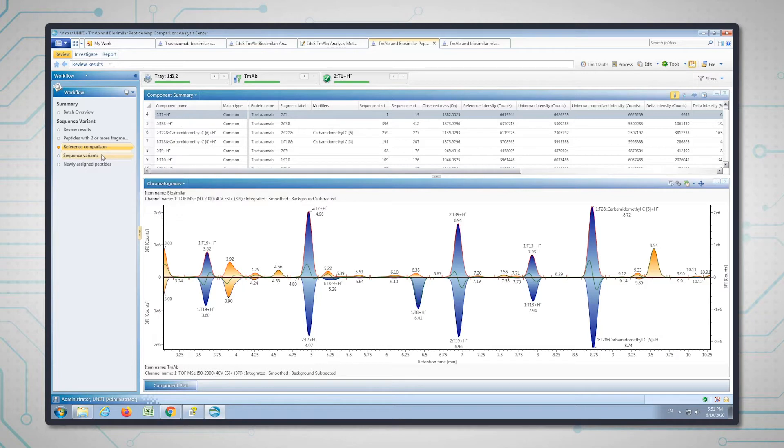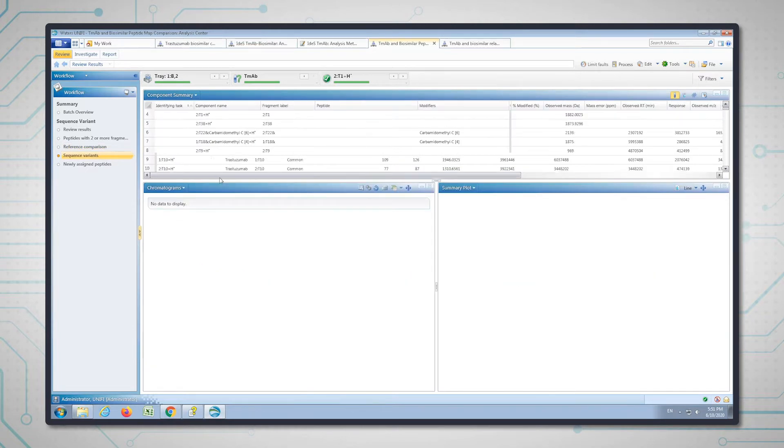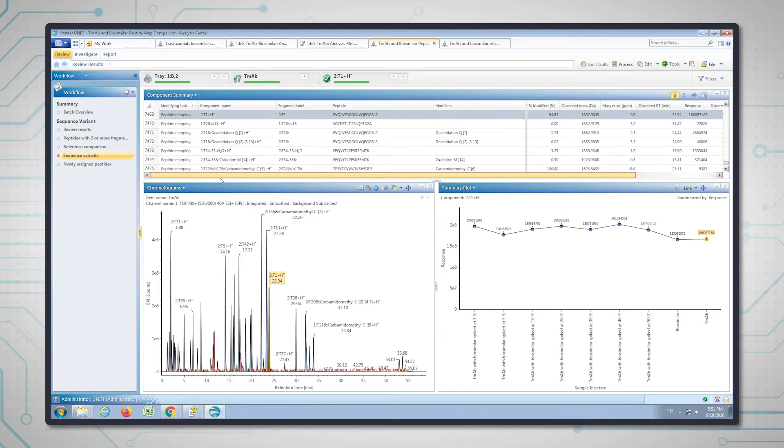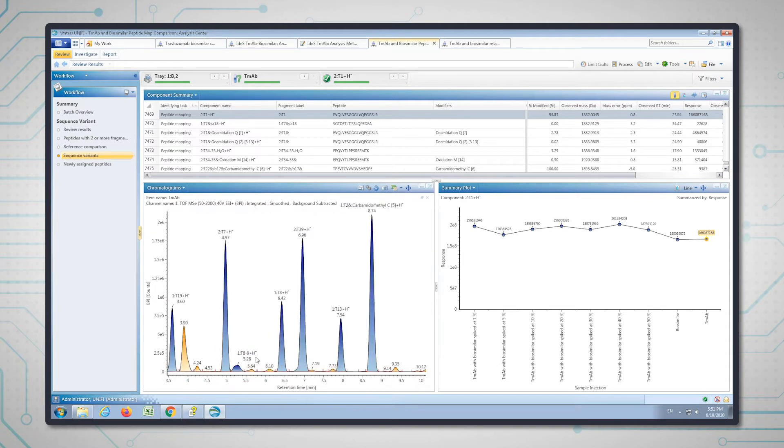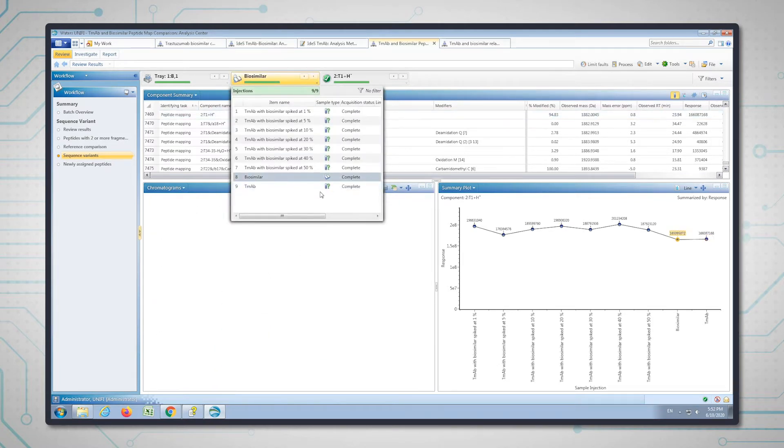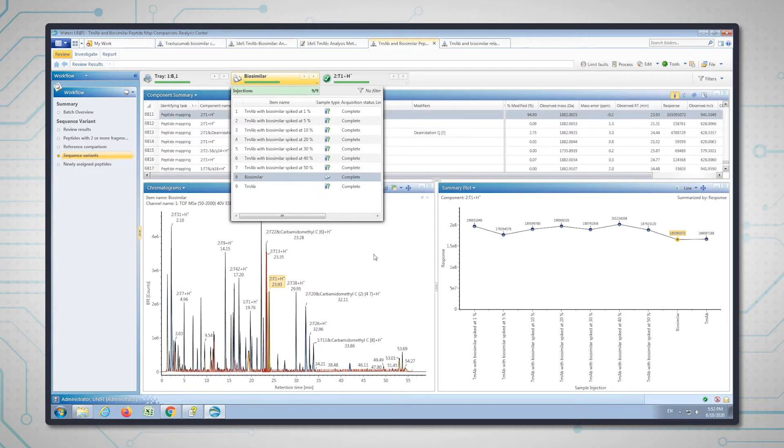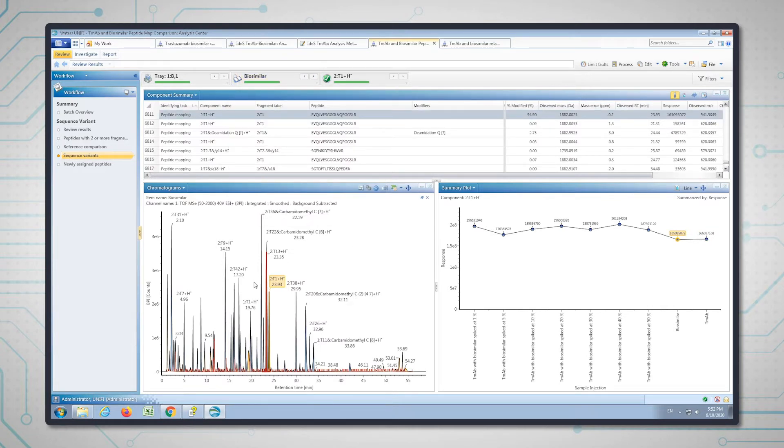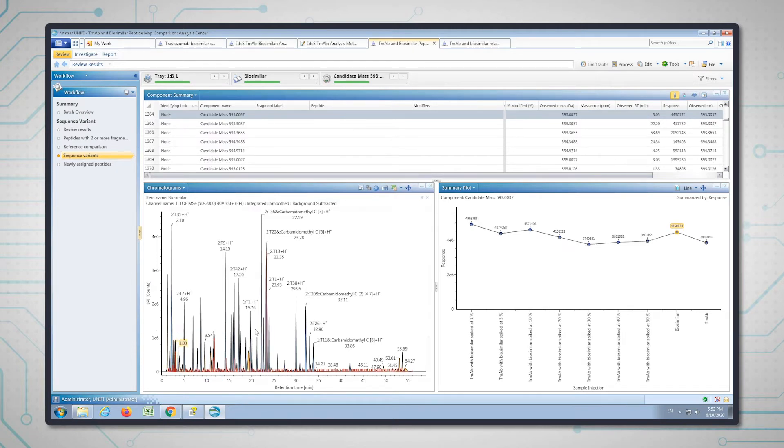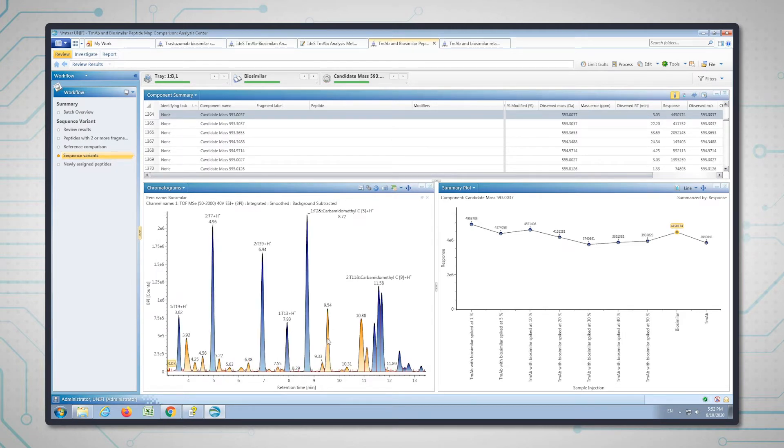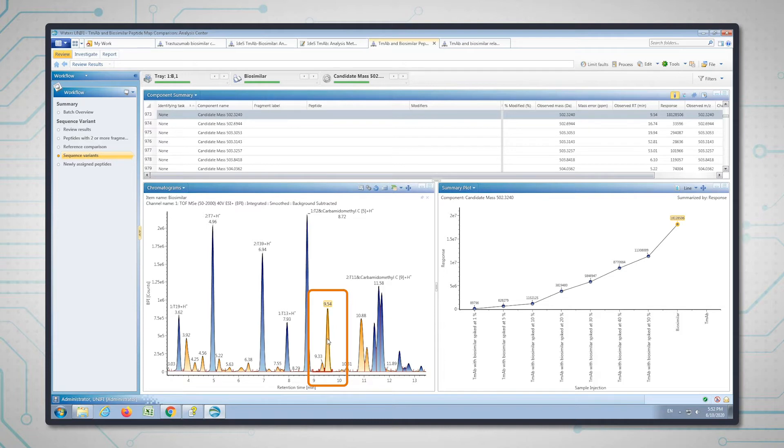In the next workflow step, the sequence variant step, we're going to target these two peptides in the biosimilar and see if we can use the tools in Unify to elucidate what the sequence is. I'm going to choose the biosimilar now because that's the one we need to focus on, and now I need to select those two peptides in the chromatogram. Let's look at the peak at 9.54 minutes and highlight that.